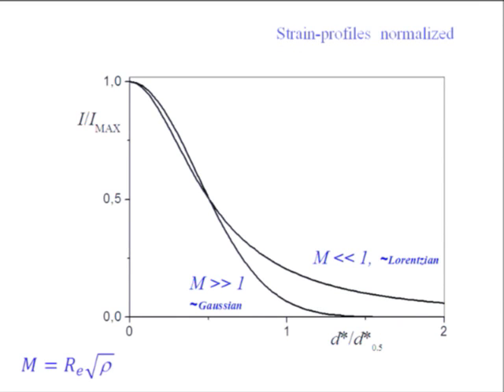And this is perhaps one of the points which has to be treated very carefully when you apply a top-down approach, like, for example, when you do a Rietveld analysis and you end up with a pseudo-Voigt function which contains a Lorentzian and a Gaussian part. You actually shouldn't say that the Gaussian part is produced by microstrain, because the strain can have a Lorentzian peak shape.